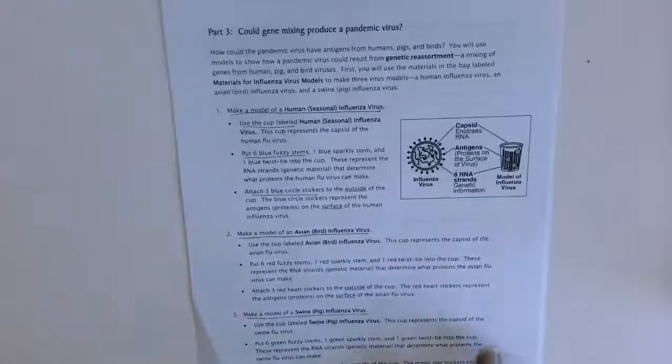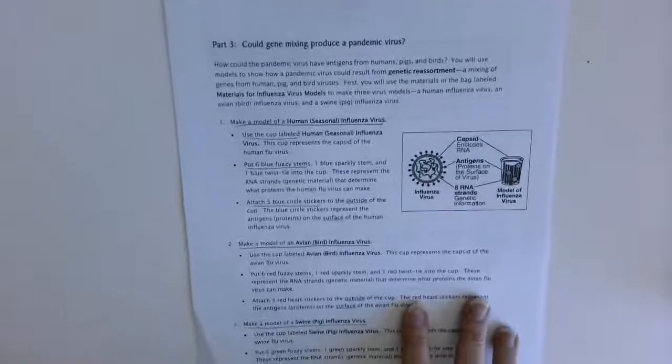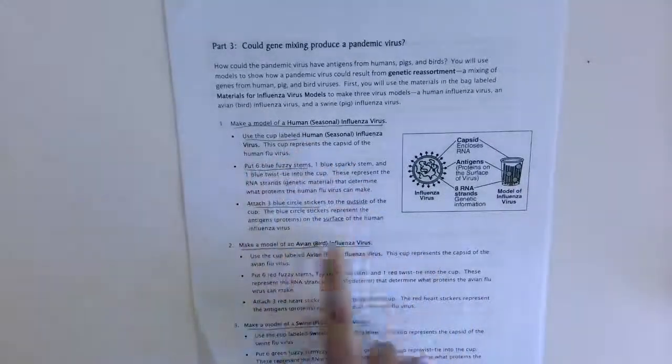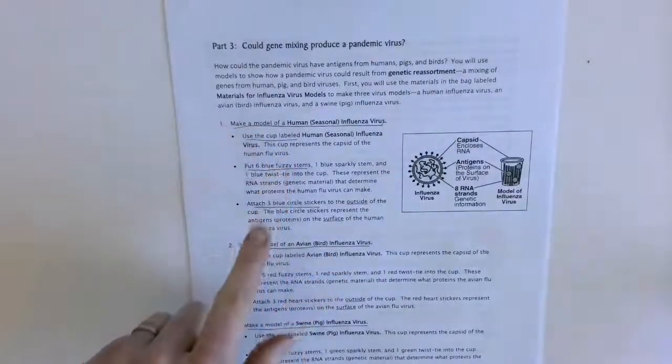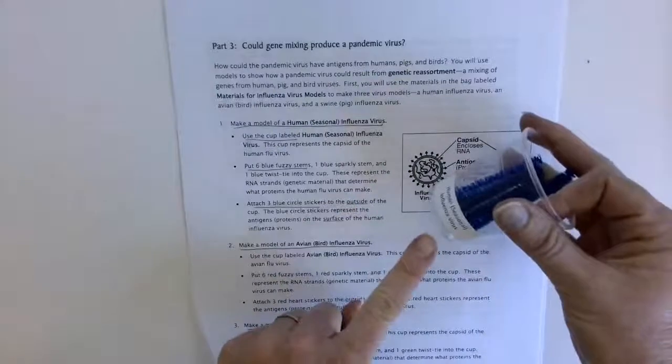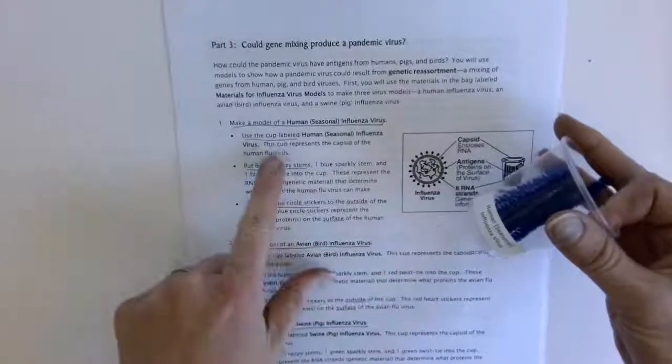You're done with the testing portion, so you can put that to the side, and you're going to move on to part 3. In part 3, the important pieces are that you are going to be really labeling your cups. This is somewhat similar to what you would expect a lab scientist to do. So for example, the labeling portion and keeping samples labeled properly for patients is really important. You are going to follow these directions. So this first one for the human seasonal virus, it says human seasonal virus. You're going to use that.